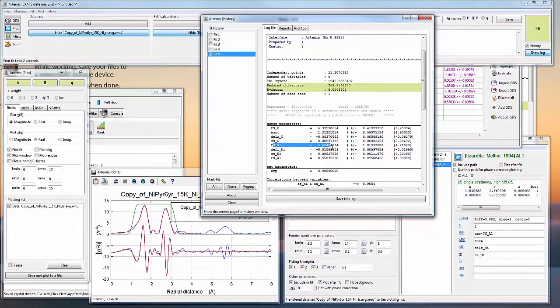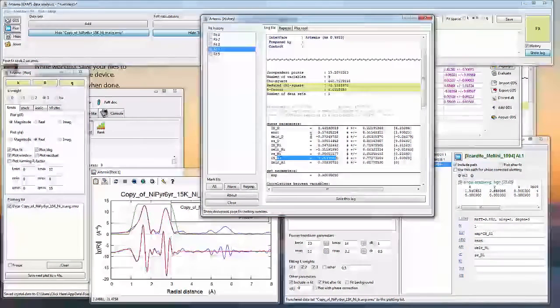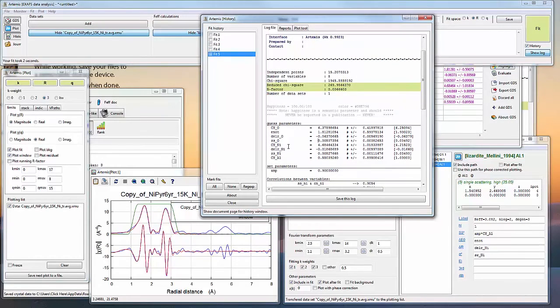Now actually what we're doing is we brought down this coordination number to a more reasonable value, because it was at 6 before and this was at 3. So that's a total of 9 atoms in the second shell of the hydroxide sheet, which is 3 more than should be there. So those values are not physically reasonable, which is why I'm continuing to push this fit by adding different restraints. So what I did here is, now I force them to be at the same exact distance.